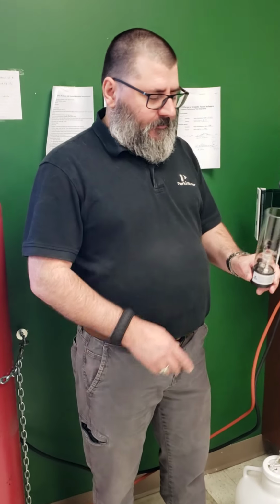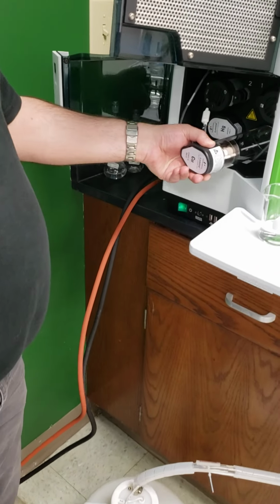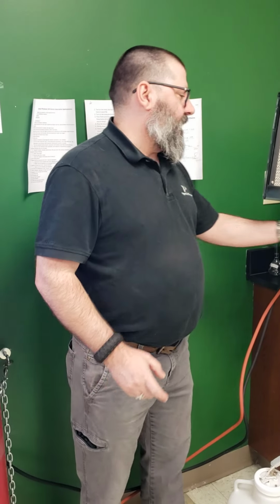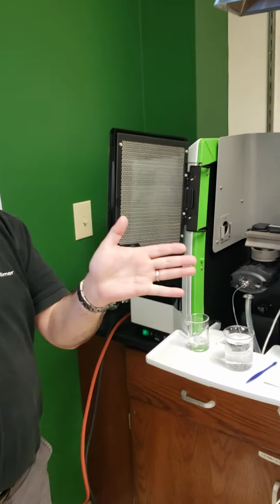So we have a lamp, and there's actually copper in there. You can see the copper color. If you excite that copper, it will be emitting photons at the energies at which photons of copper are emitted when the electrons jump from shell to shell, or from orbital to orbital. It will emit photons at specific wavelengths of light based on that element. Those wavelengths will be transmitted through mirrors into the system, into a spectrometer, which will separate that light out.